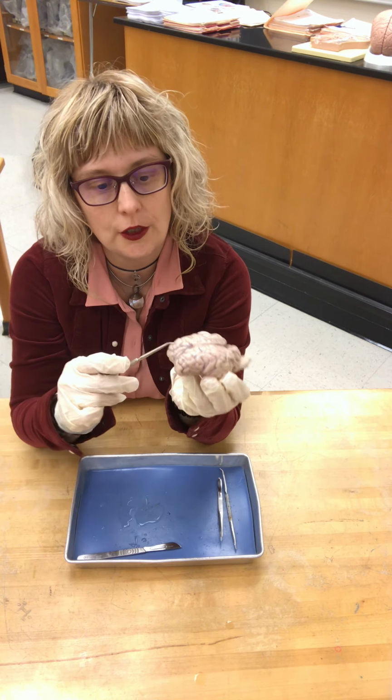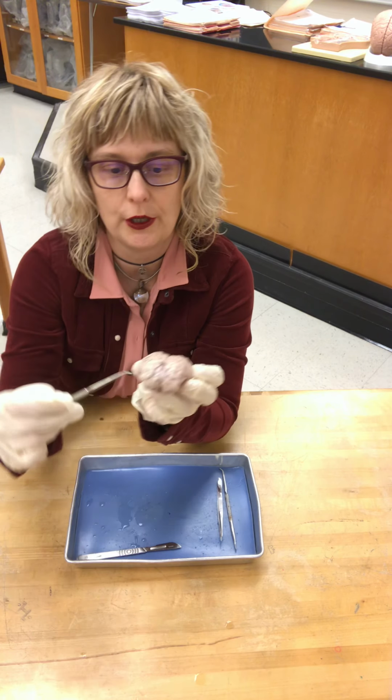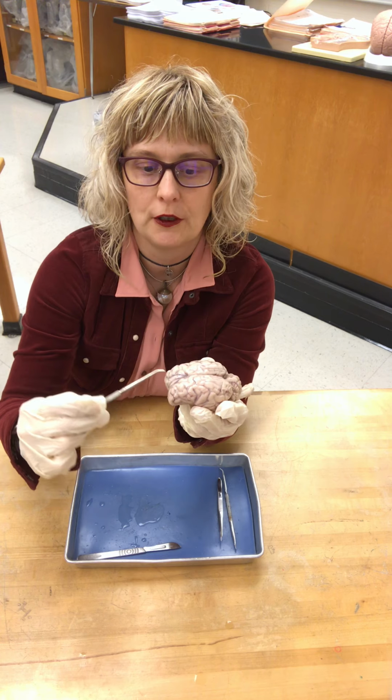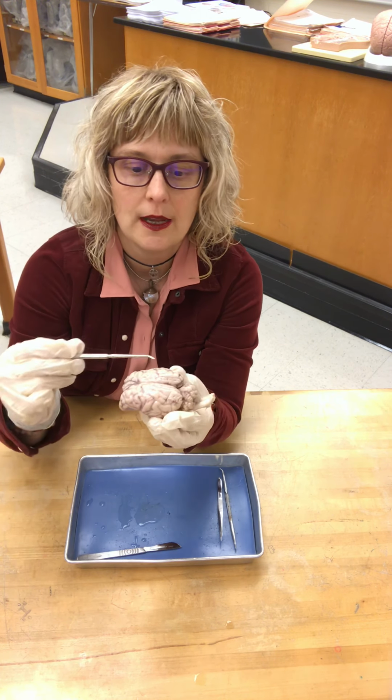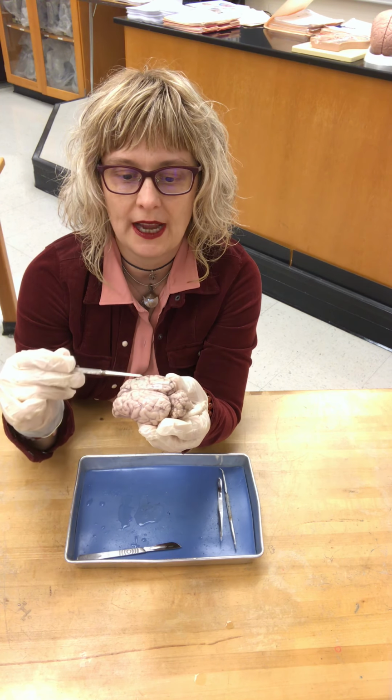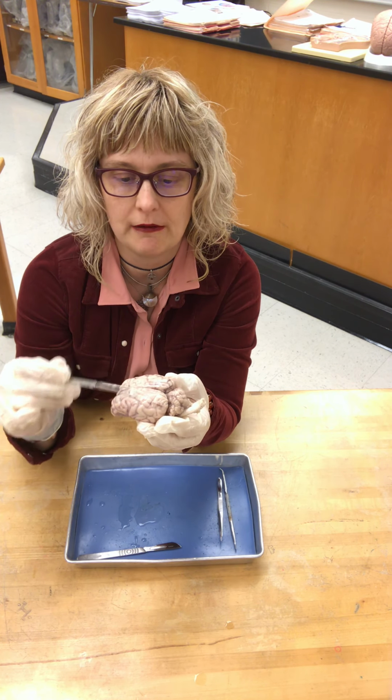underneath the skull, you have this frontal lobe. So you have the left frontal lobe and the right frontal lobe. Then you have the parietal lobe here. You'll have the prefrontal cortex. You'll have the somatosensory region here.